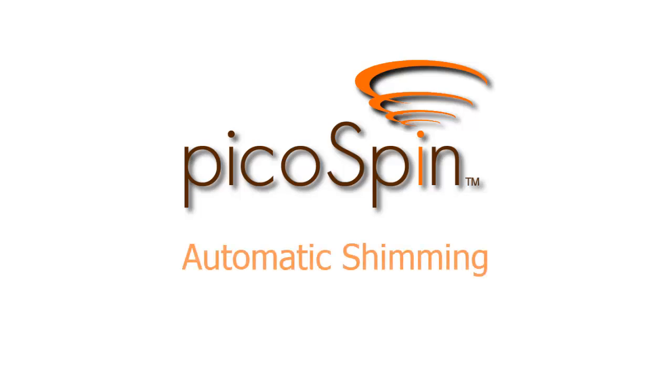The subject of this video relates to the process of automatic shimming of the PicoSpin 45 NMR spectrometer. In this video, we'll discuss maintenance shimming.